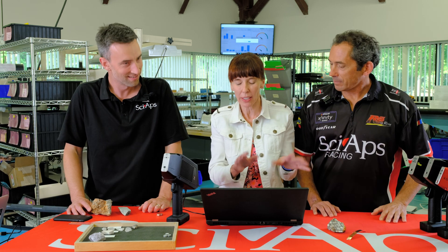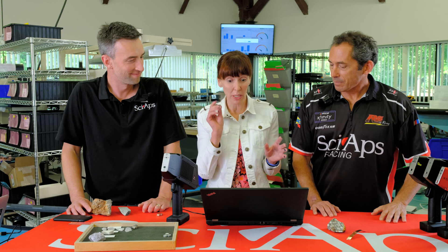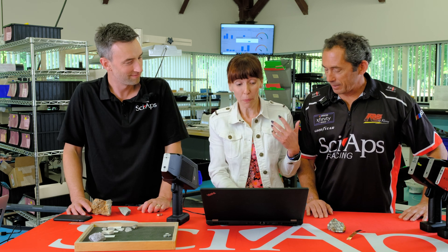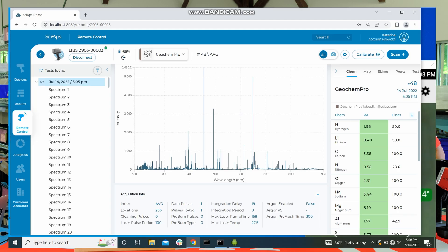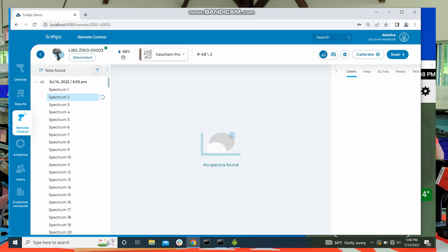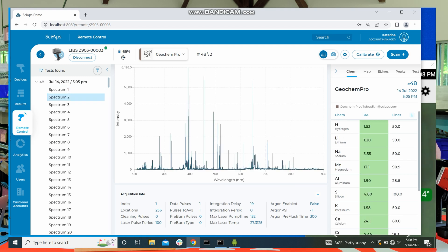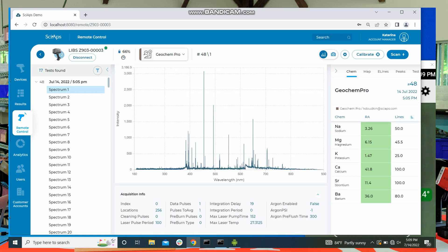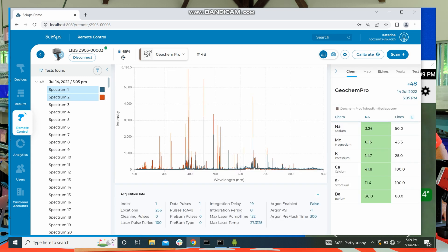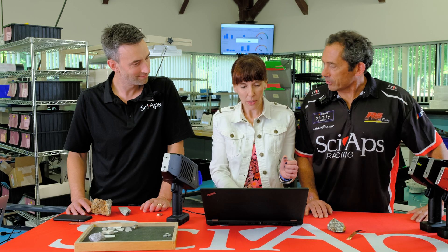No one noticed how quickly the result got back — we got results almost instantly. We collect spectrum from all 256 shots and you can see them on the list, so you could explore them one by one. These are all the little spots that we shot along that rock. You could multi-select and see two of them together and see the difference. Show the picture — show the map.